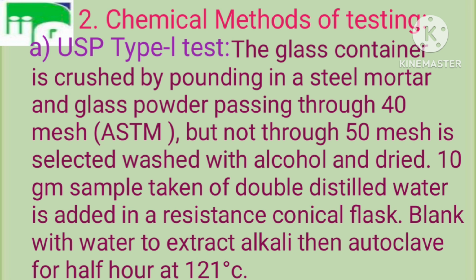The glass container is crushed by pounding in a steel mortar and glass powder passing through 40 mesh as per ASTM, not passing through 50 mesh, is selected. Then the selected glass powder is washed with alcohol and dried. 10 gram of sample is taken and distilled water is added in a resistant conical flask.